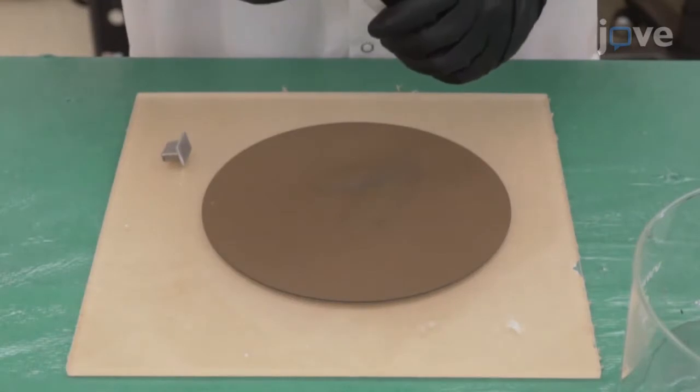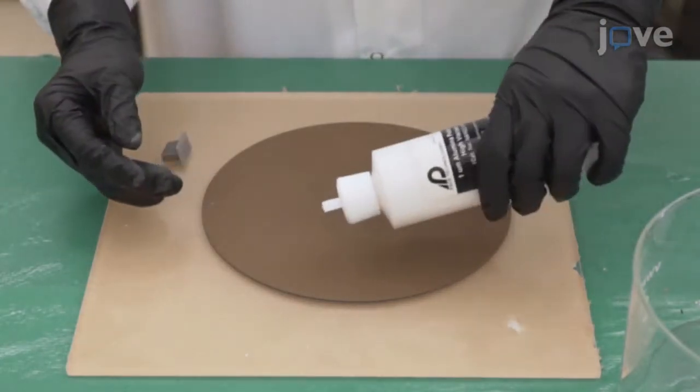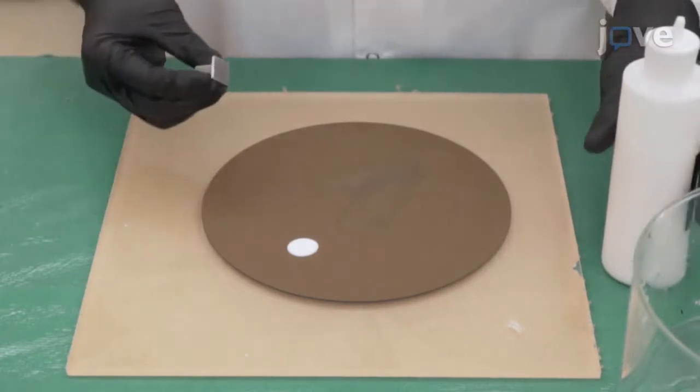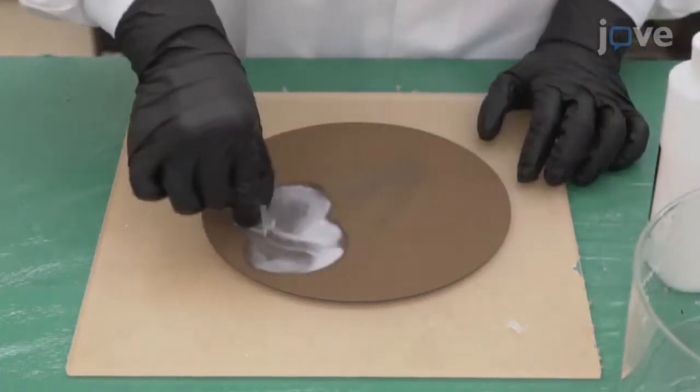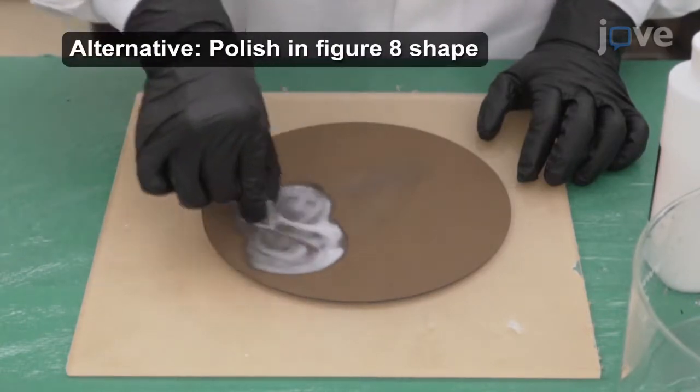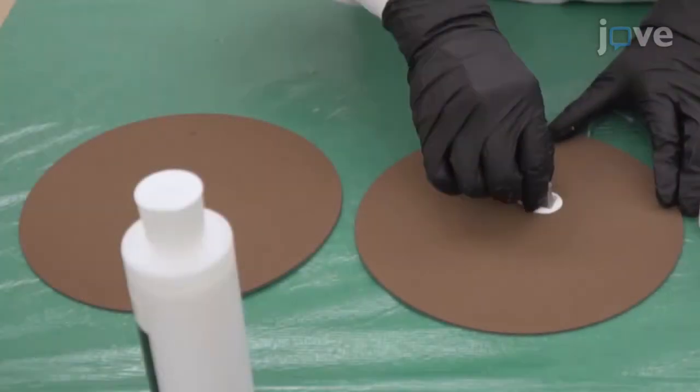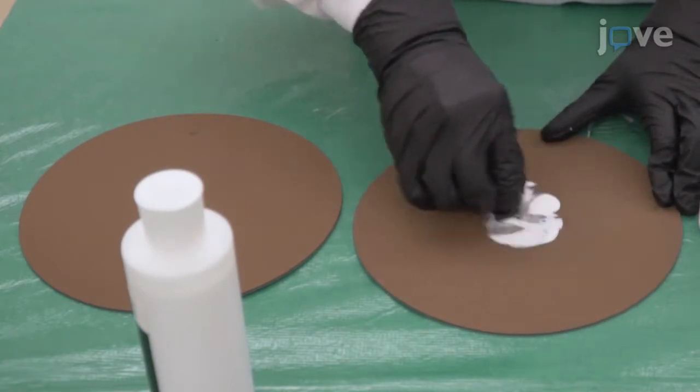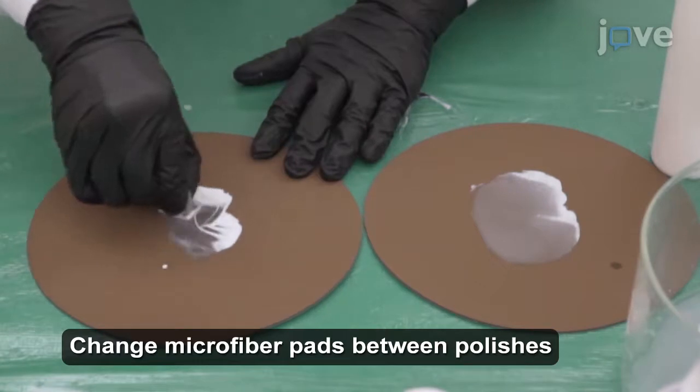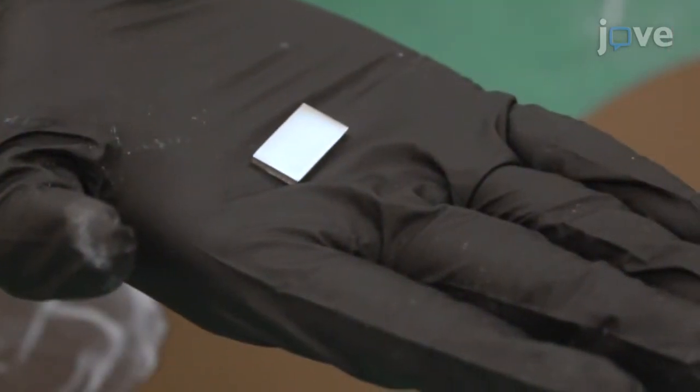After the last grinding, pour one ounce of a 1 micrometer alumina suspension onto a clean microfiber cloth pad and polish the sample in one direction until the scratch lines have been removed. Then polish the surface with 0.3 and 0.05 micrometer polishing suspensions until a mirror finish has been achieved.